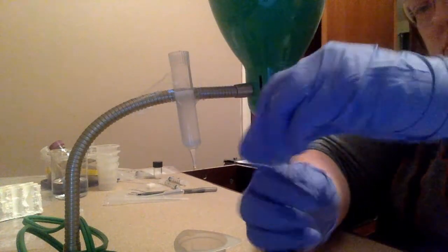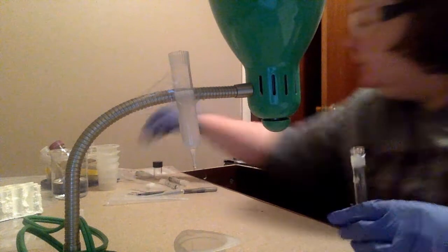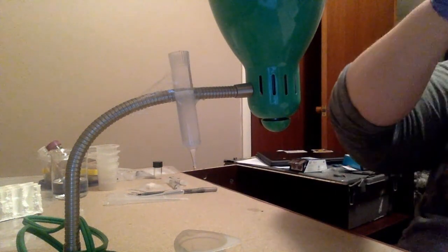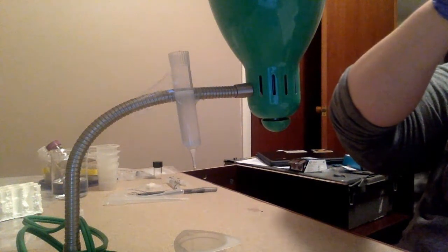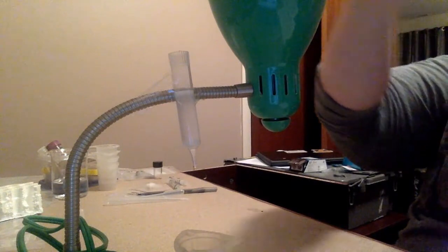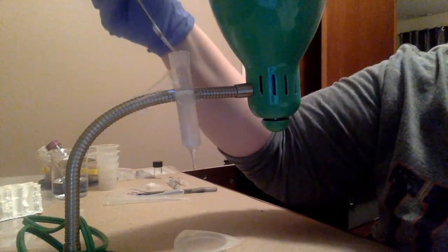Alright, it's nasty looking. Get my little sample. 0.3. Alright, so I'm going to add this into the top.